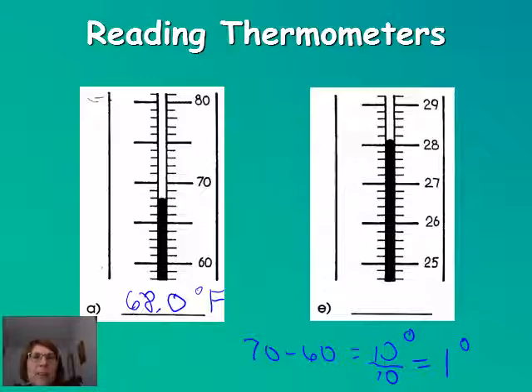All right. So the deal is that you have to be really careful about what that interval is. So here we have 27 and 28. So we're going to do 28 minus 27, which gives us 1. And then we count 1, 2, 3, 4, 5, divide by 5. So what happens is that that ends up, if we put it in our calculator, to be 0.2. So that's a different interval than what we've had before.